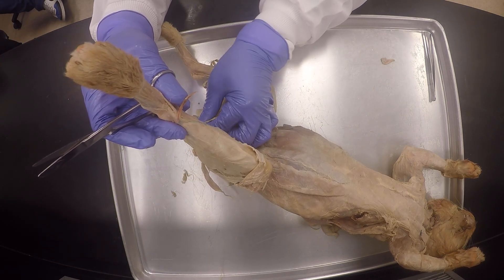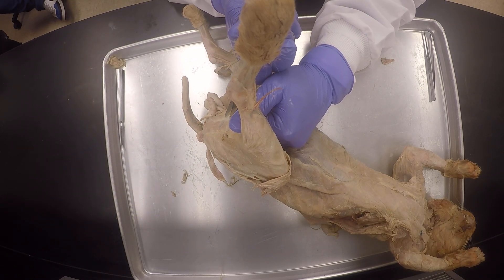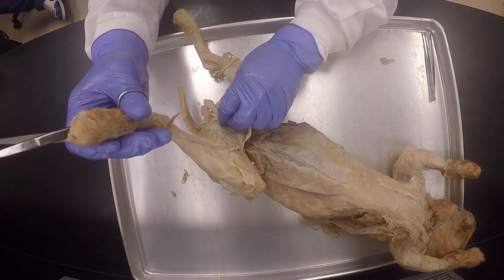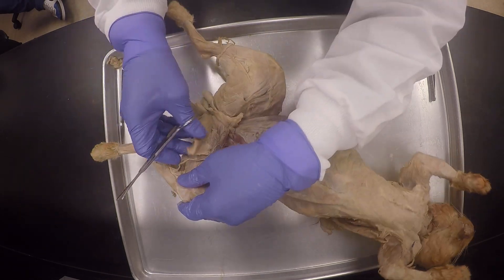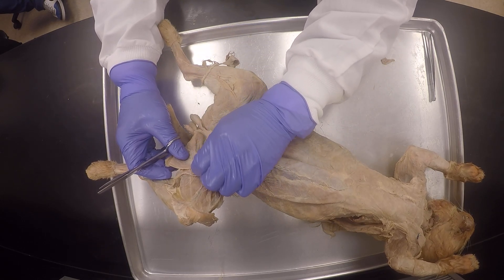I'm going to continue to peel it off like that. Okay, you see my cobwebs — my connective tissue? It means my separation is good, it's A-okay. And you can see the line here, so I can continue to peel off a little bit.